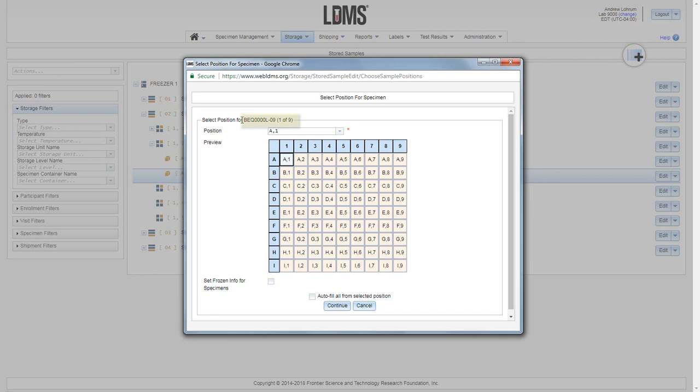At the top we see our global specimen ID and the number of that specimen in the queue. We have 9 total specimens selected. The first available position is selected for us in blue. You can always override that by choosing a new position. If you check the set frozen info for the specimens, they will be assigned a frozen date and time as you assign the position.